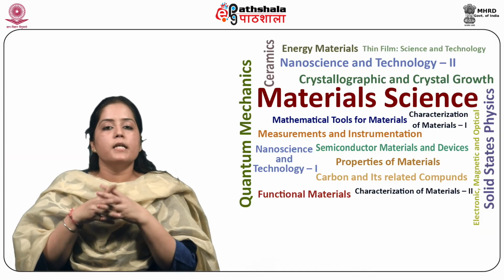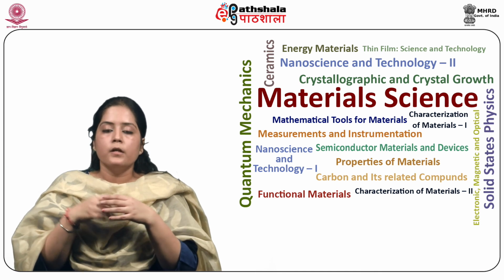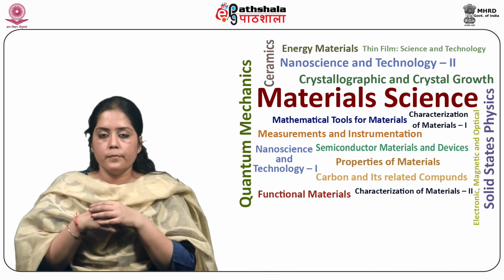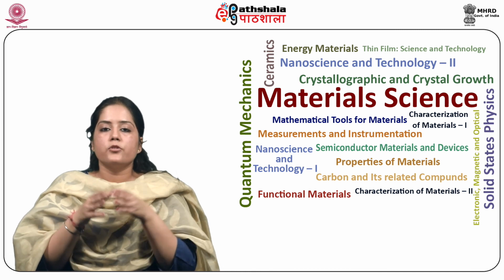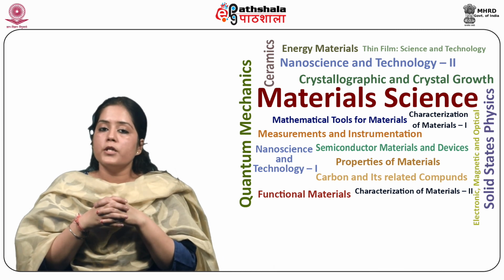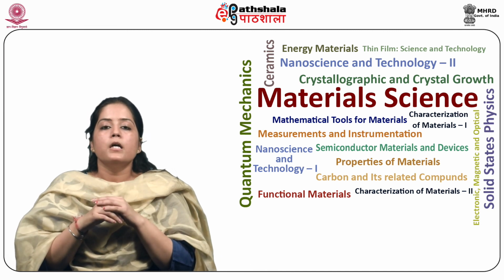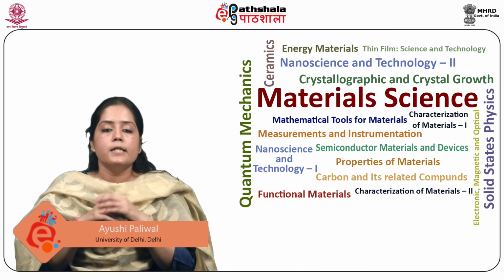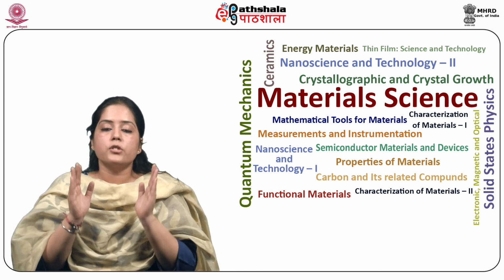So students, let us summarize what we have learnt in this module. Firstly, we discussed the UV visible spectrometer. Secondly, the principle of the UV visible spectrophotometer was discussed. Thirdly, how to measure the optical band gap was discussed in detail. Lastly, the UV visible spectrophotometer instrument details were discussed with a detailed description of each component.